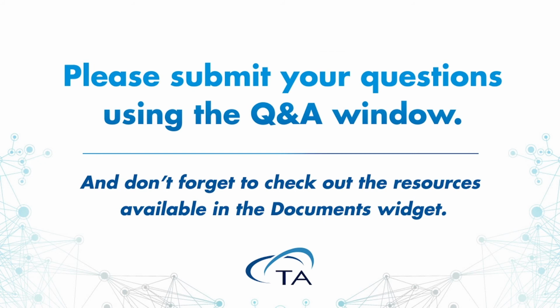Okay, questions continue to come in, so I only have time for one more, but what we're going to do is answer the remaining questions by email. So you will get an answer in the next day or so. But I've only got one more: how can I determine if an interaction is positive or negative with only DSC? If interaction is positive or negative, I guess that means whether there is interaction or isn't interaction.